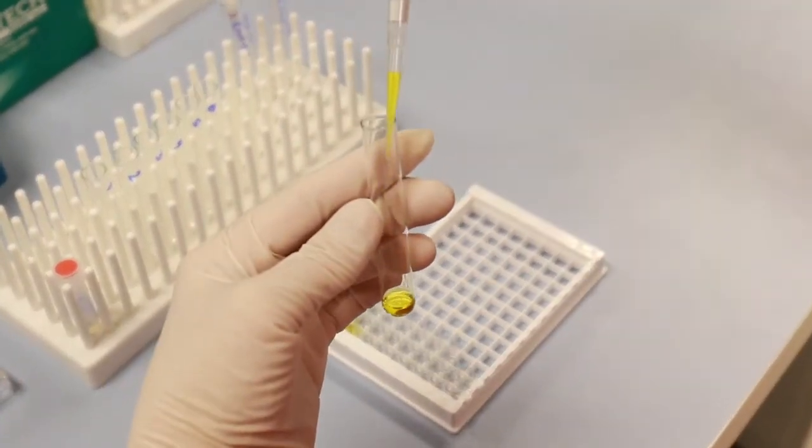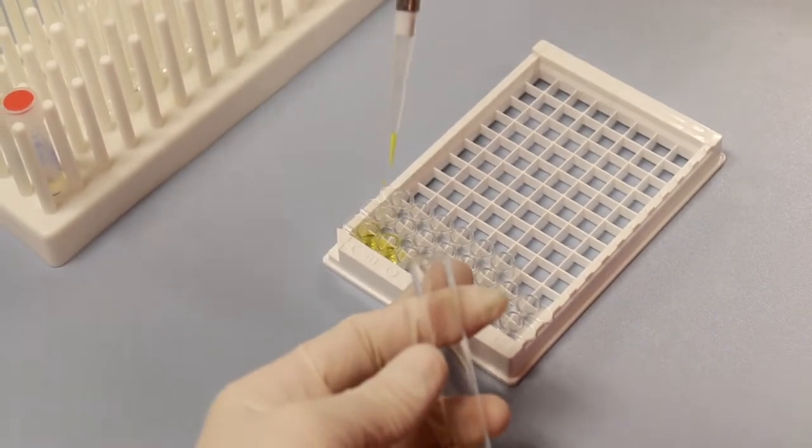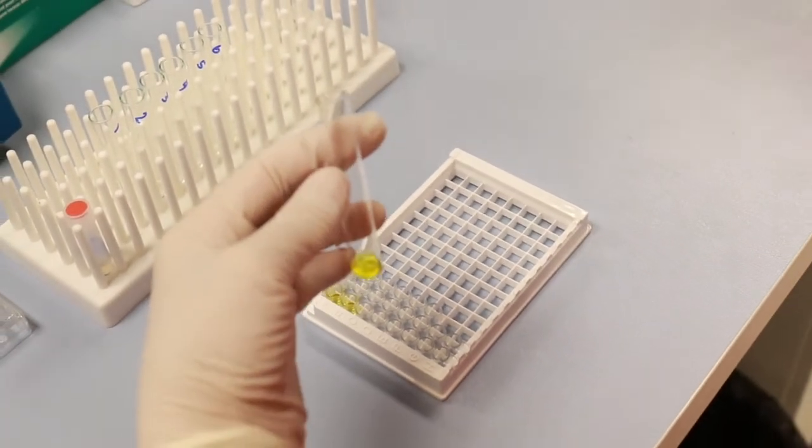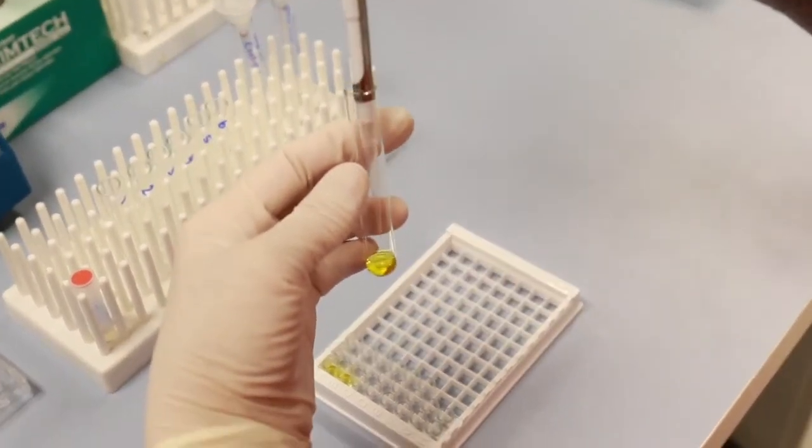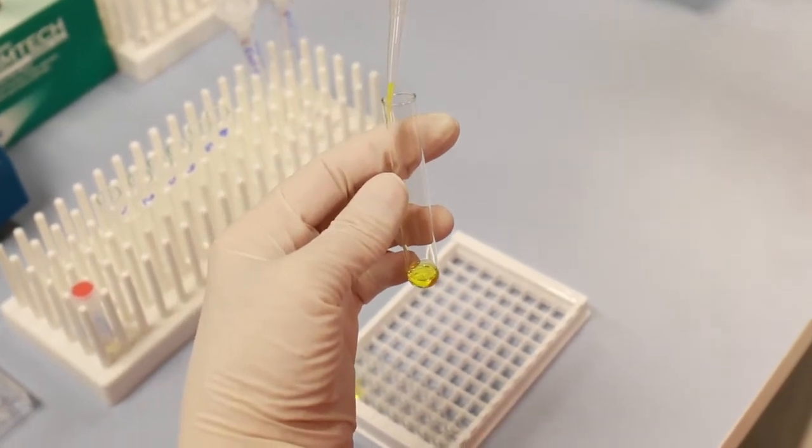Some of our kits recommend reverse pipetting. In this procedure, the pipette tip is overfilled and then the volume to be dispensed is added to the well by pushing down just to the first pipette stop.